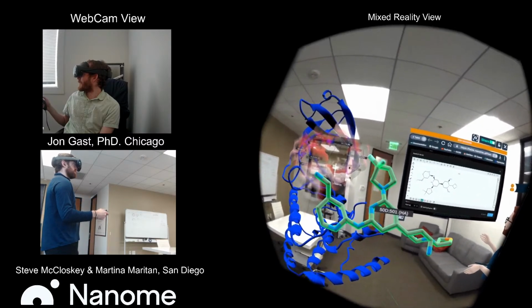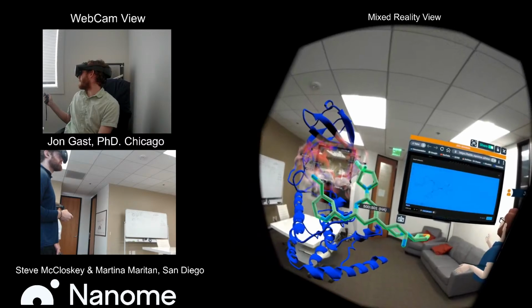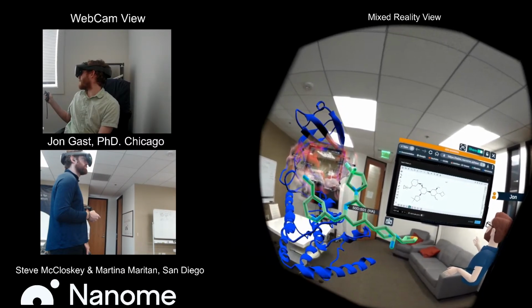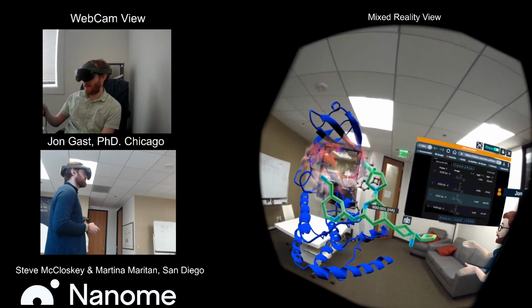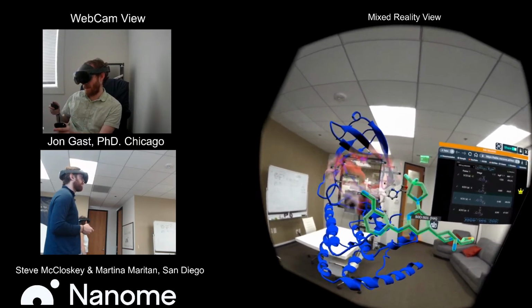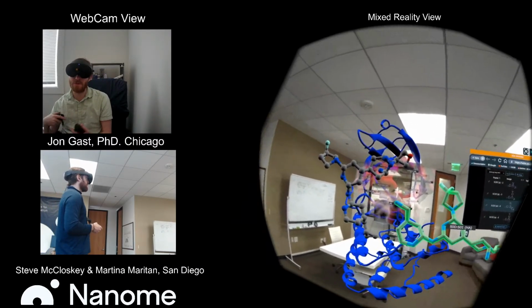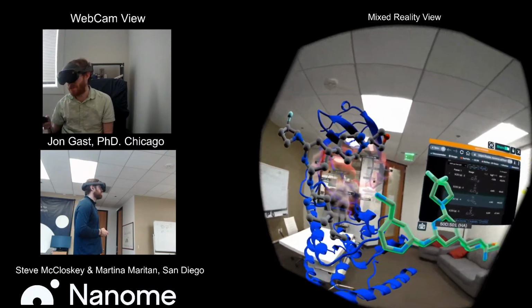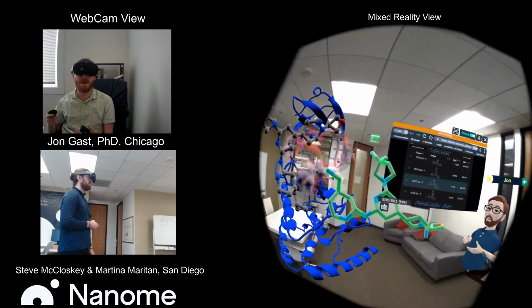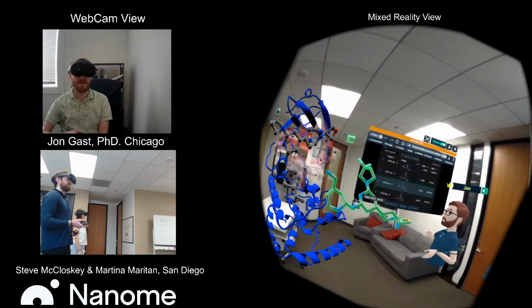Well, and what's great too is with our sketcher that we've added very recently, I can even propose changes outside of being presenter, outside of VR. And this new molecule that just came in is the molecule I just built in the data table. So you can both suggest new changes molecularly and change the view. The data table really allows groups to work together and do things concurrently.